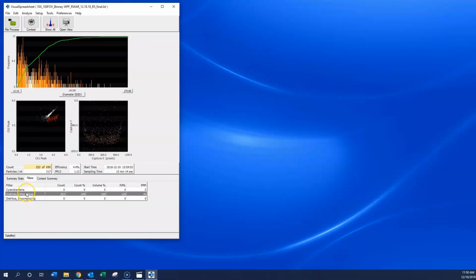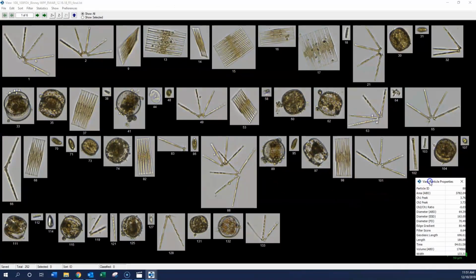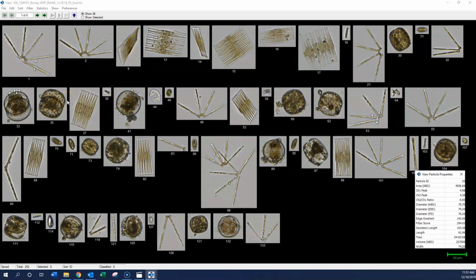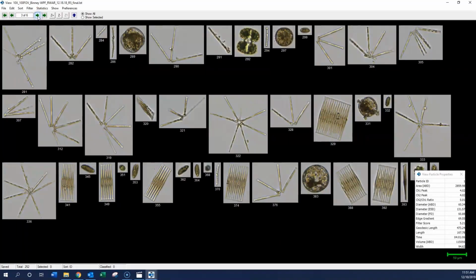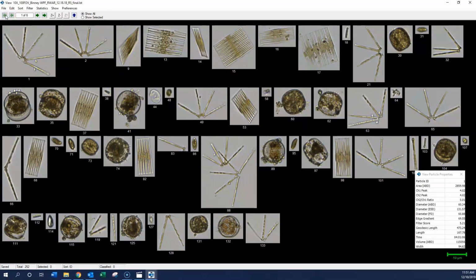As we highlight this group of diatoms and algae, we can begin to get a sense of the organisms that are actually in here and identify up to the genus level, in most cases, who's in the sample. What we need to do is begin to order the data by the type of organism that it is instead of just the rough, raw data set that you're seeing here.